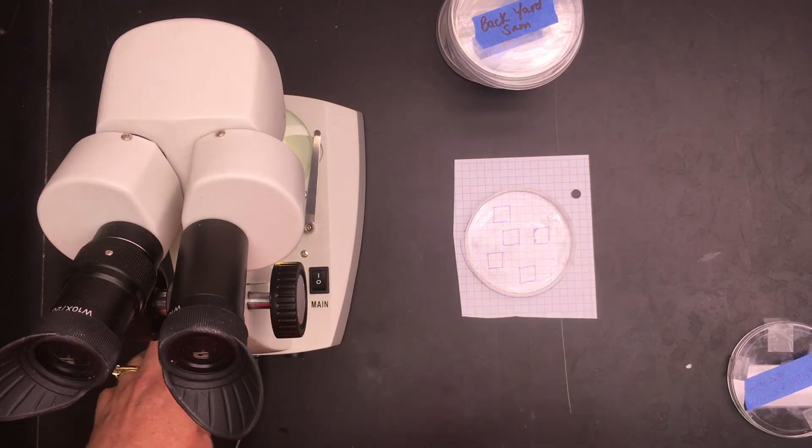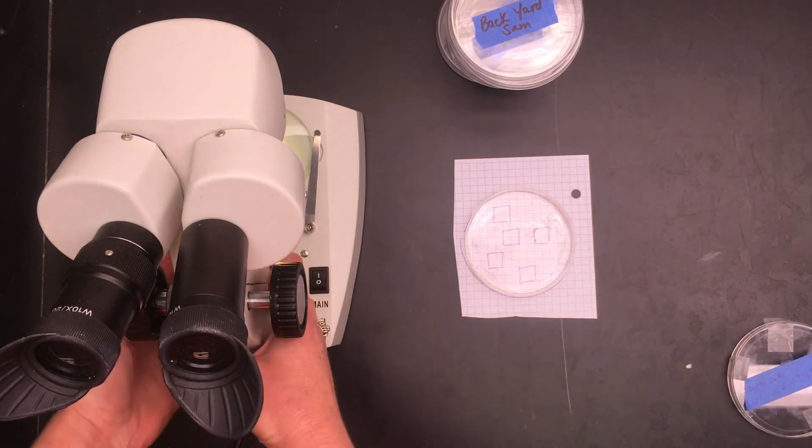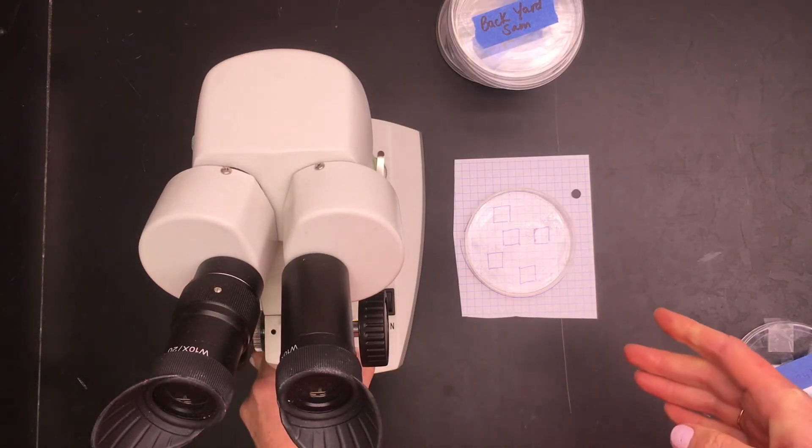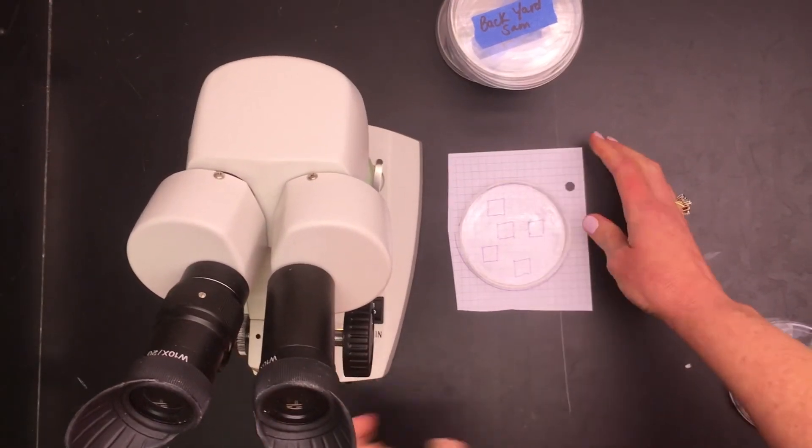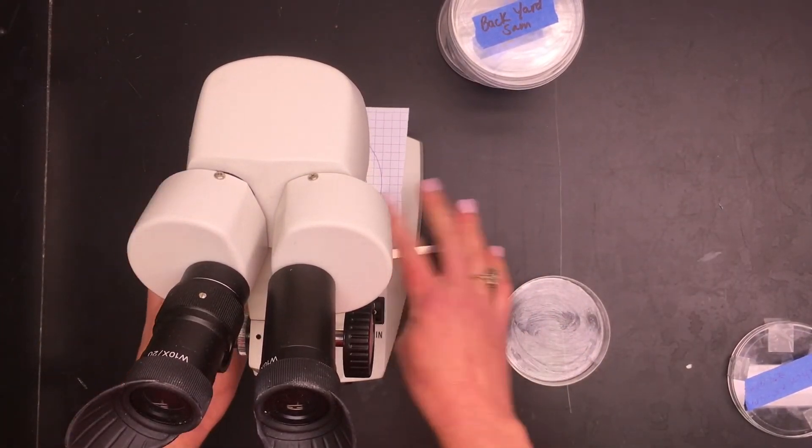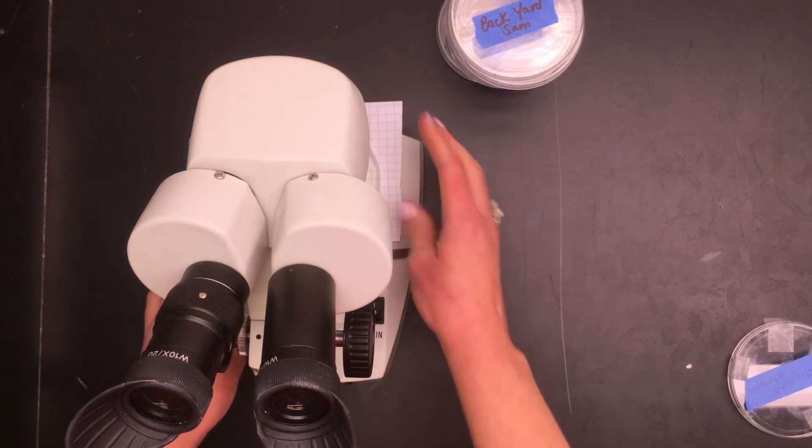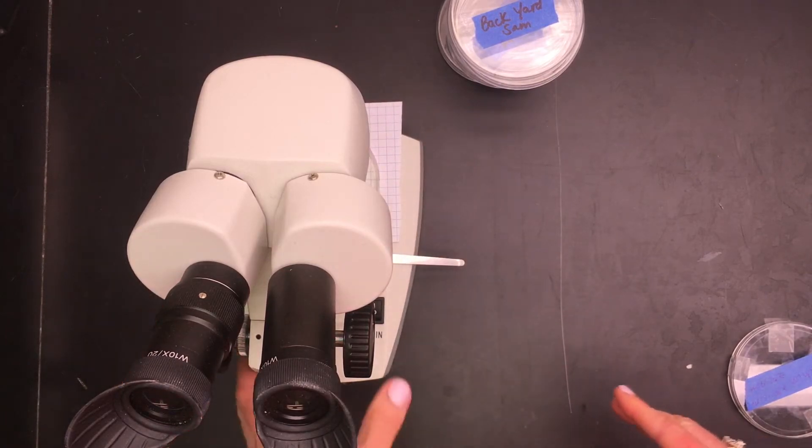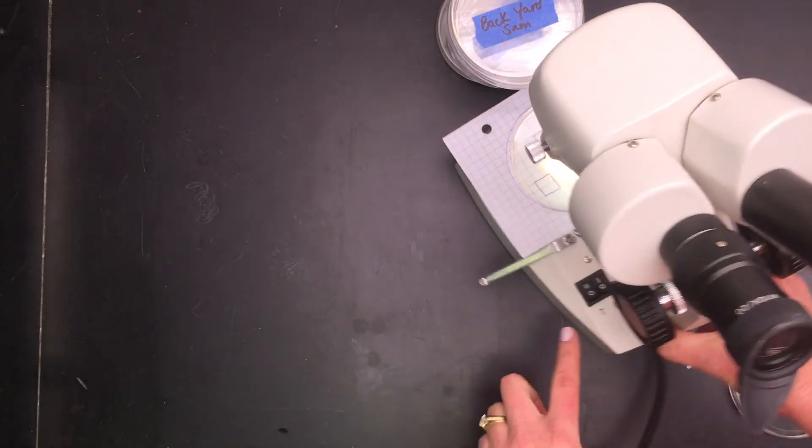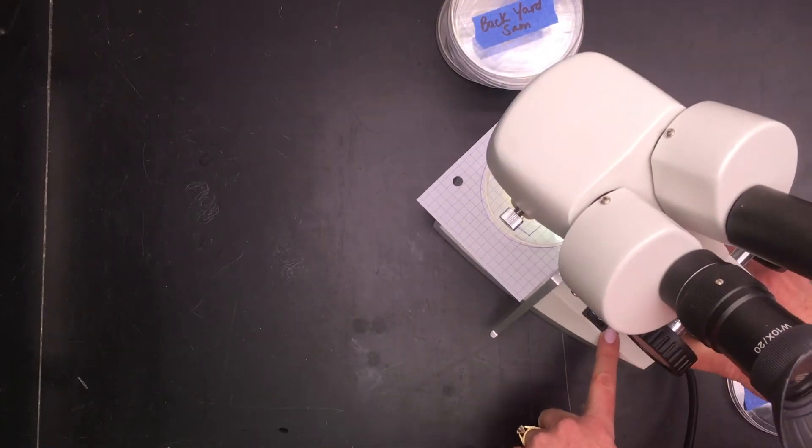You're gonna place your dish on your template and then also on a stereoscope. The stereoscope has light that shines up from the bottom and also down from the top. Take your template and place it on the stereoscope, and then your petri dish as well on the stereoscope.